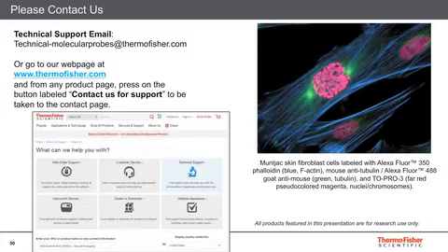When I was teaching microscopy to beginning science students, inevitably the hardest problem they had was just learning to look through the eyepieces. And you have to worry about your glasses and the eye width and all that. So don't worry about that with these scopes. A monitor's great. Everything's digital.